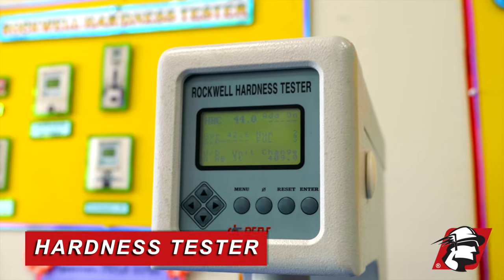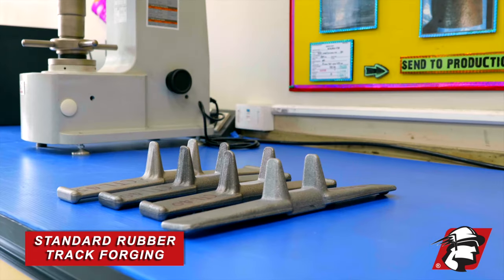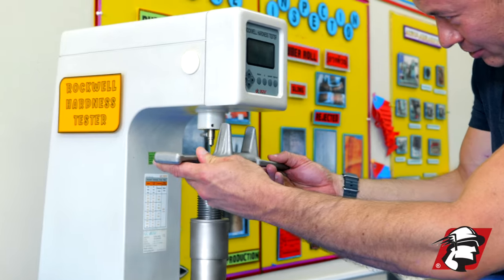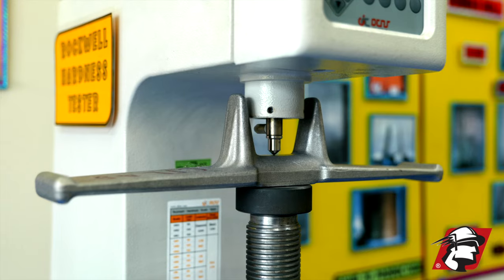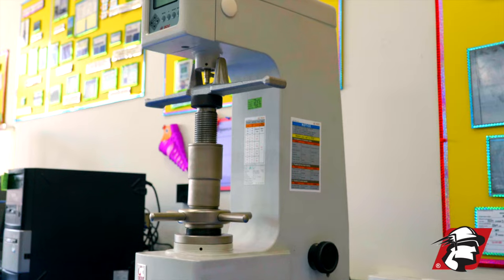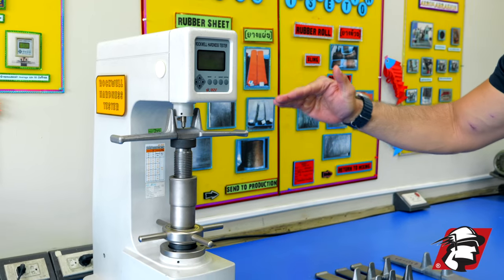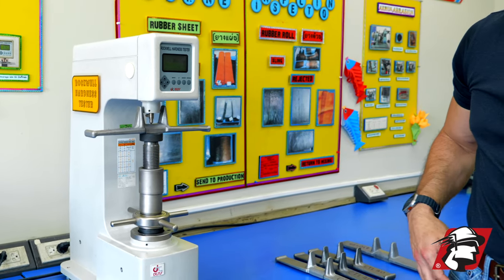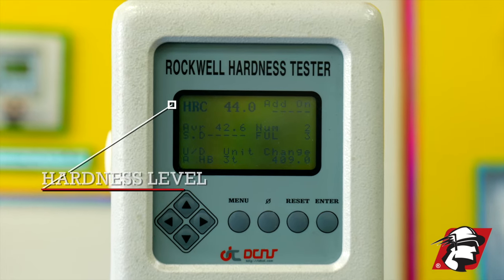This is a hardness tester — HRC. This is a standard forging that goes into one of our track loader rubber tracks. I'll go ahead and load that, and we're going to engage the metal piece onto the hardness point. Now it's engaged and loading the weight against the point, then it drops down and tells us the hardness in HRC. It shows us 44 HRC.